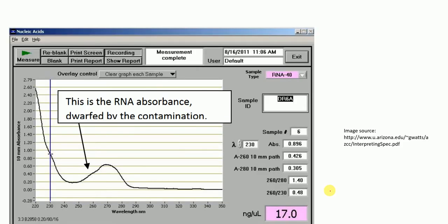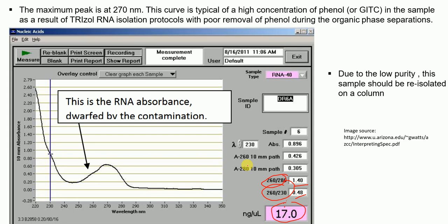In a third example, both the 260/280 ratio and the 260/230 ratio are below 1.8, although the concentration is within the nanodrop range. This is a very bad sample that cannot be used for downstream applications. The peak is at around 270 nanometers rather than 260, which is typical of high concentration of phenol in the sample as a result of trizol isolation protocols with poor removal of phenol during organic phase separation. This sample should be re-isolated.